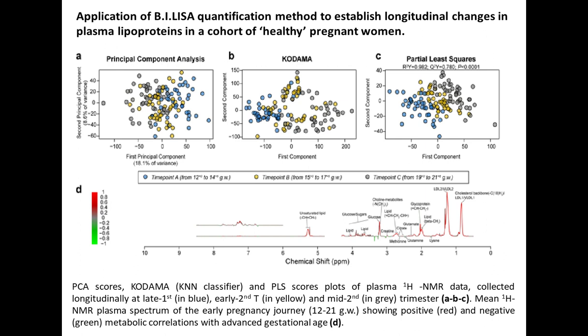And now I'd like to finish by showing you a couple of applications. So one of the things we do here is to look at pregnancy and complications of pregnancy. And before we look at complications of pregnancy, you should look at normal pregnancy. And across the total gestation period for hundreds of women, we collected samples and we ran the profiles using standard NMR spectroscopy.